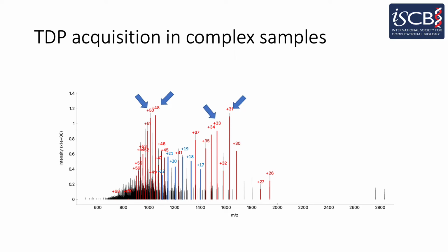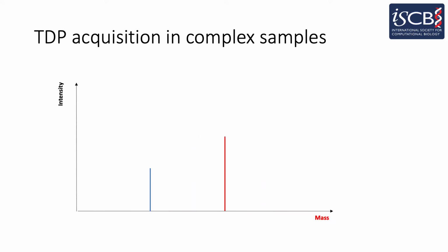Even if the blue peaks form perfect charge distribution and isotope patterns, none of them will be selected in this scenario. If we have deconvoluted masses from the previous complex raw signal, the acquisition becomes far simpler and distinct masses can be easily selected.